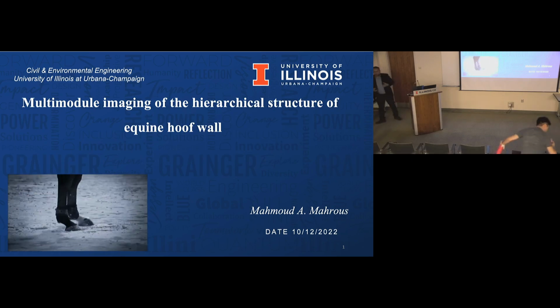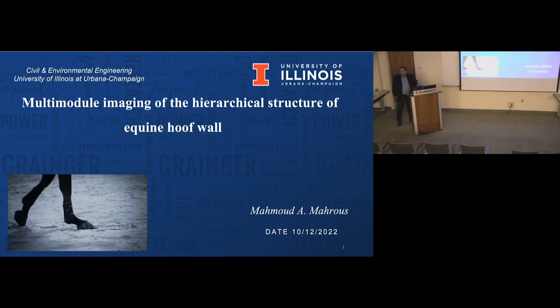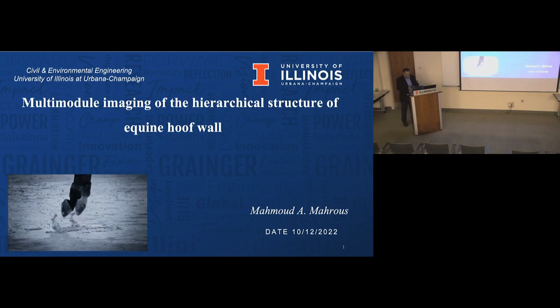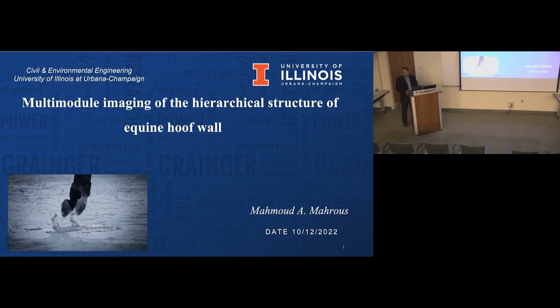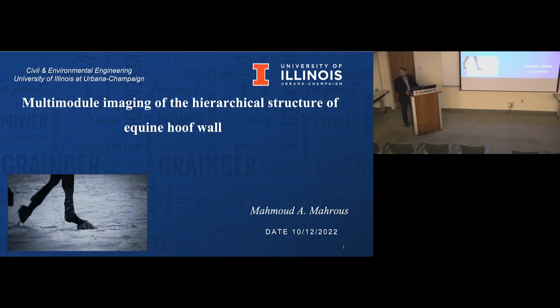Today's speaker is Mahrous, and he's speaking about some work he's done in the core with the X-ray CT system and also our serial block face electron microscope system.